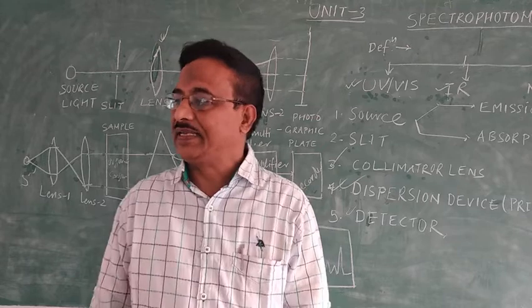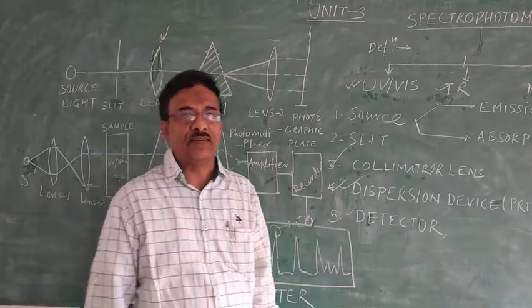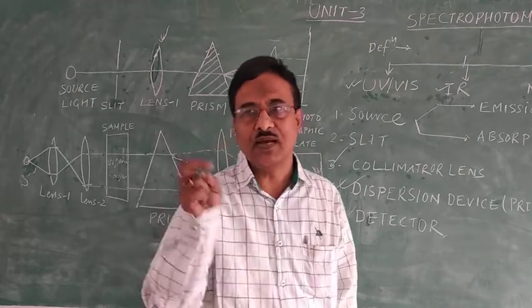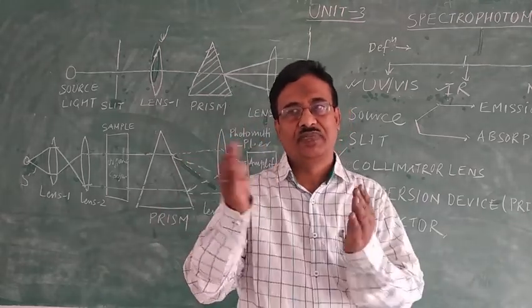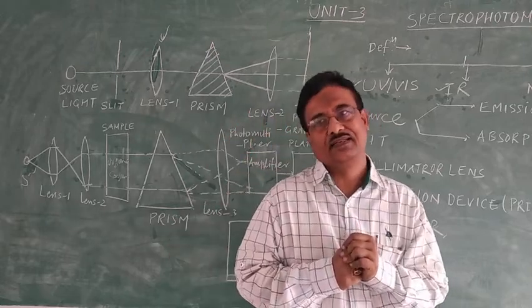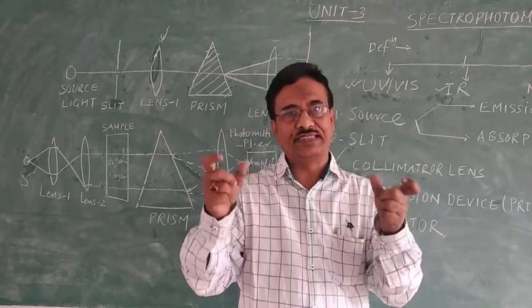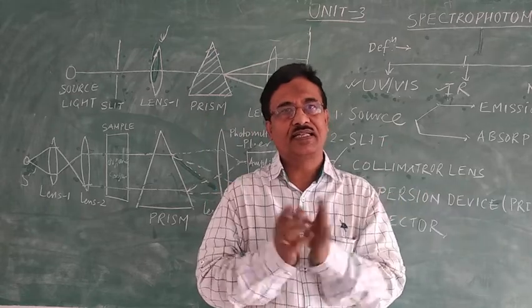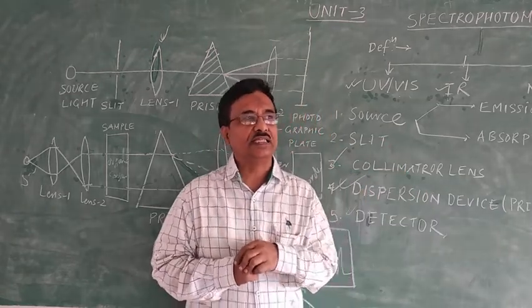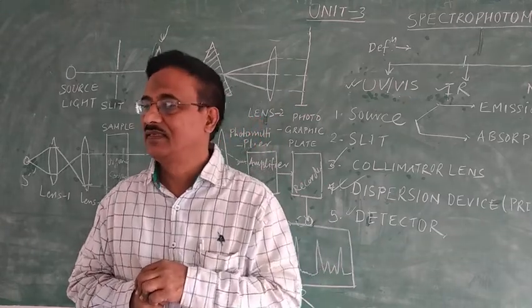The fifth point is it is also used in beverage industries. Do you know about beverages? That is how to drink, like rum, whiskey, types of drink. That is beverage industries. For detection, we use this spectrophotometer.